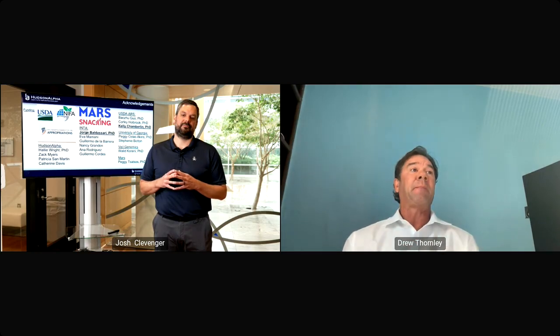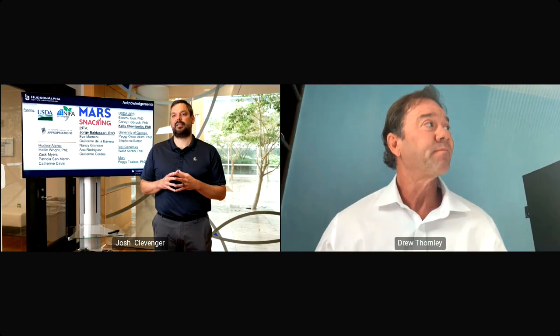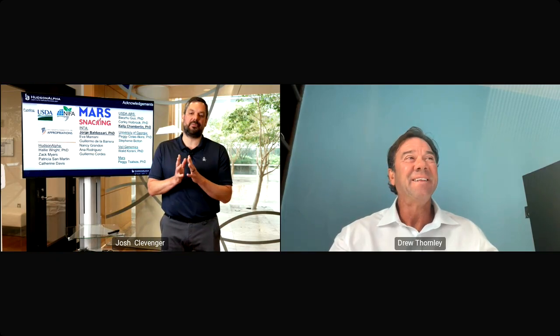Fabio asked, what was the most difficult step that you had to adapt to introduce the low-pass whole genome sequencing in the routine? That's an awesome question, actually. All the steps are difficult, but I think the most difficult step is really dialing in the DNA extraction.